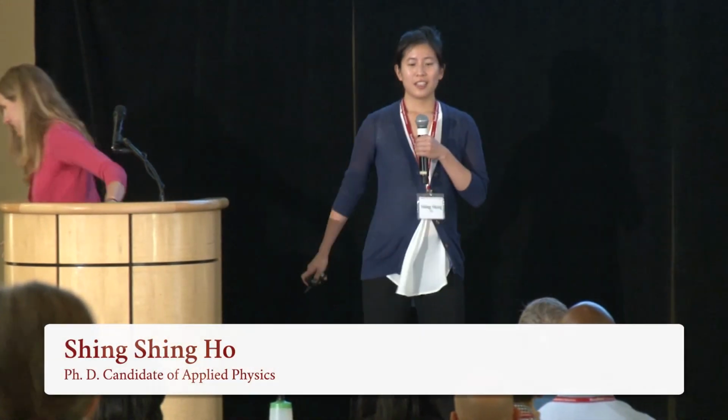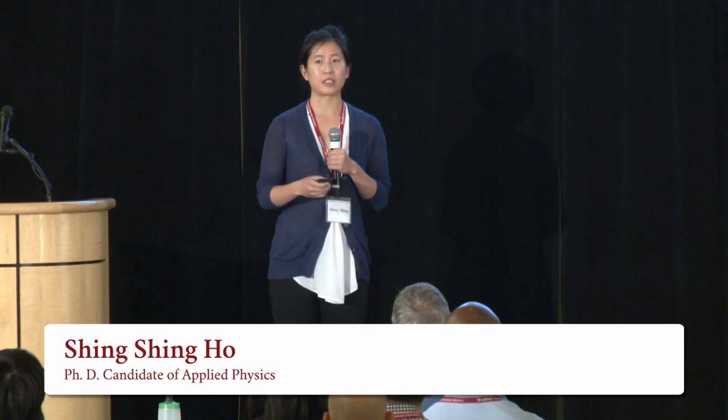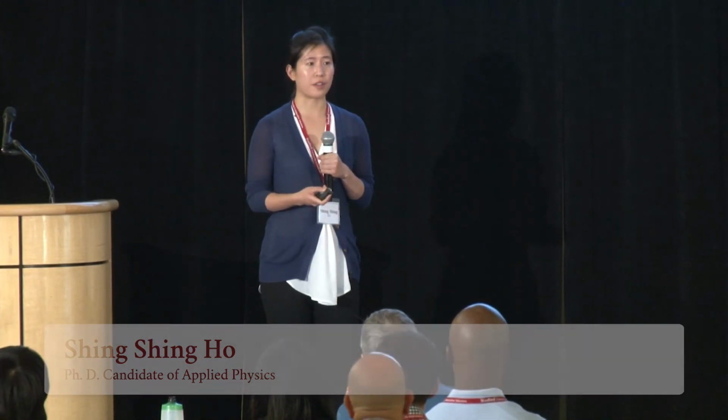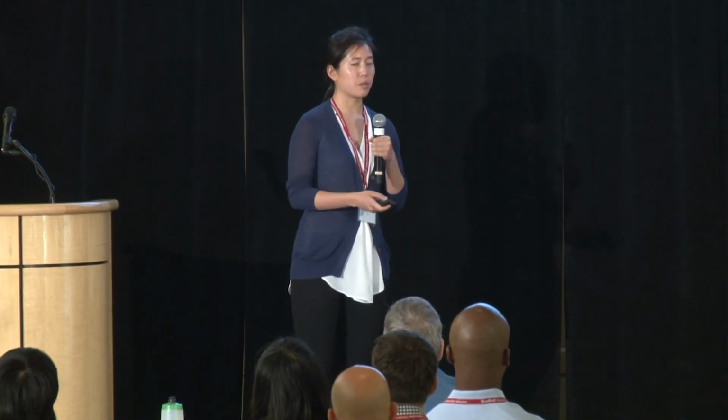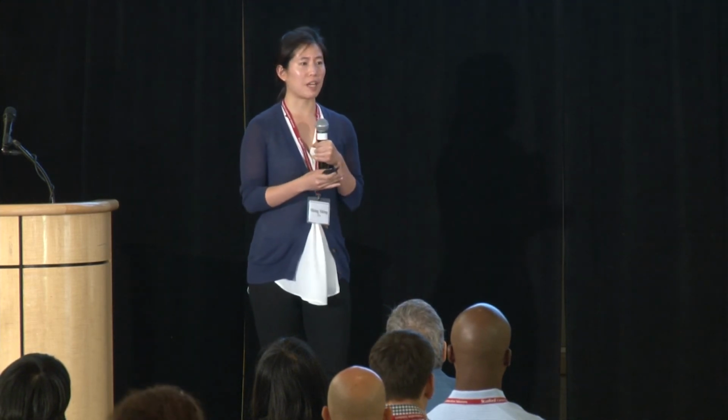Thanks, Jen. So when we started the project, we wanted to make sure that we could tell apart different bacterial species and strains based on just their Raman spectra. So to do this, we developed a Raman database composed of many different types of bacteria.